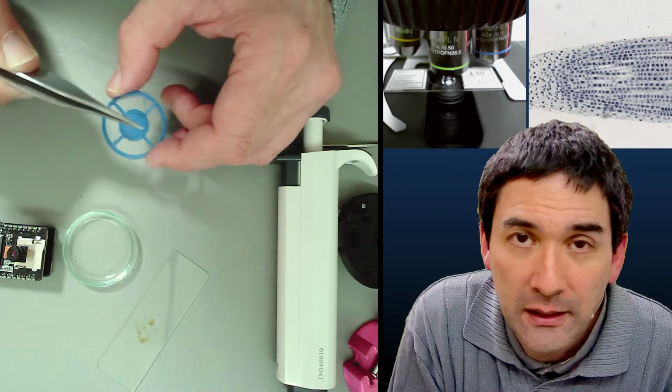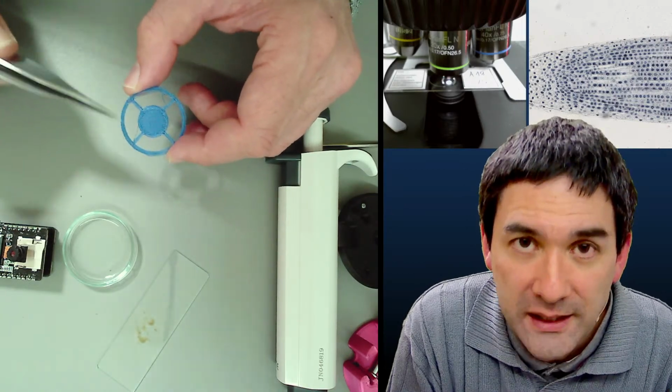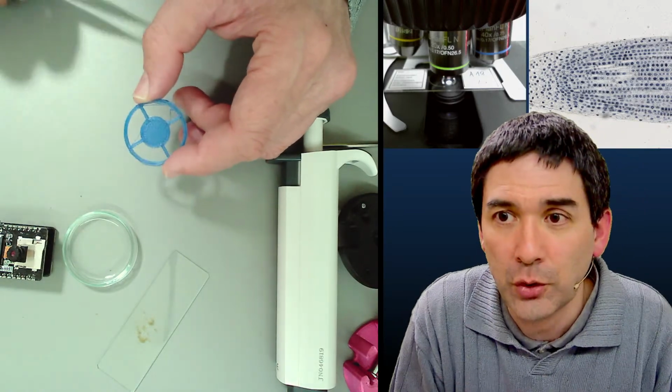Honestly, a microscope that has a condenser and a filter holder, I have yet to see one which does not work. Okay, but you do need to have a microscope with a condenser.